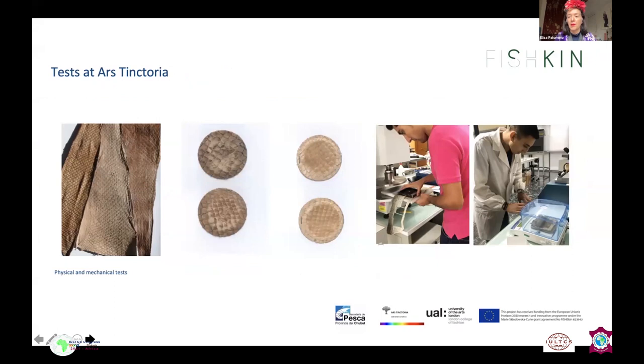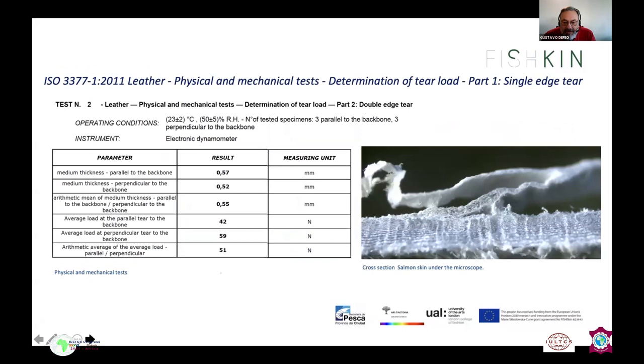Thank you, Gustavo. Yes. Well, hello. So we ran several tests on fish skins for these projects and others. And what was most impressive is the tensile strength that the material can develop. We also tried some tests with the Martindale abrasion tester, but clearly the results were not excellent. The effect was very similar to what is normally achieved with snake skins, and that is due to the pockets where the scales are placed.